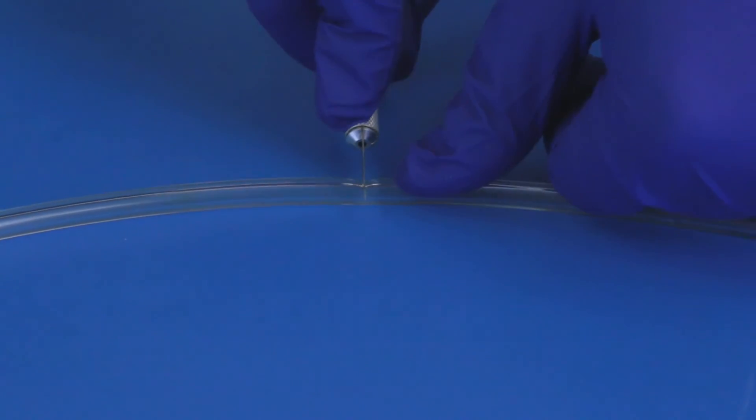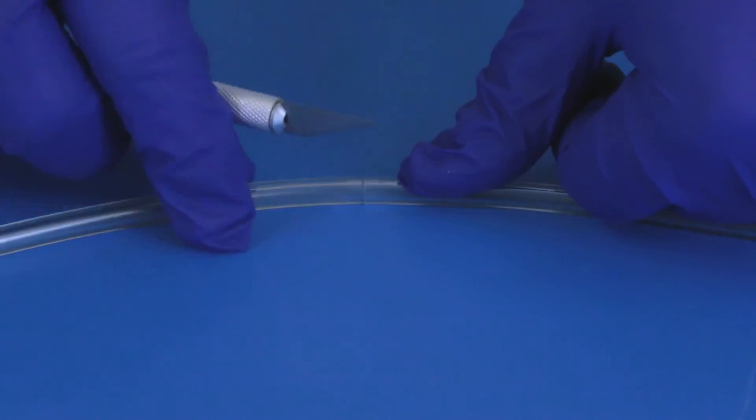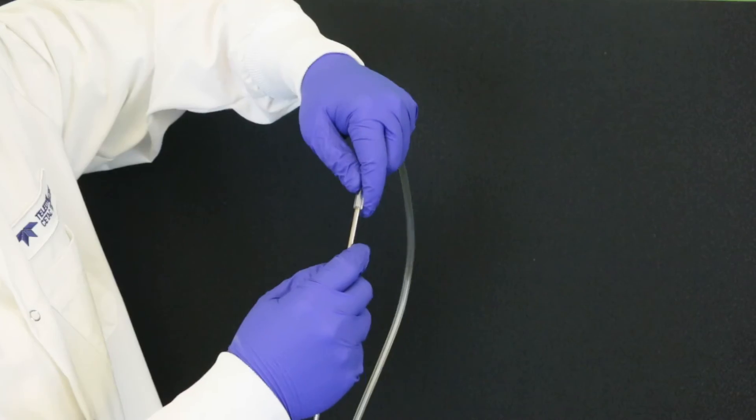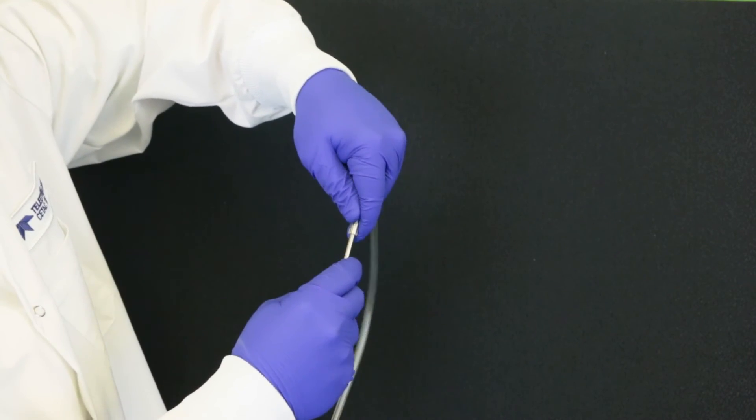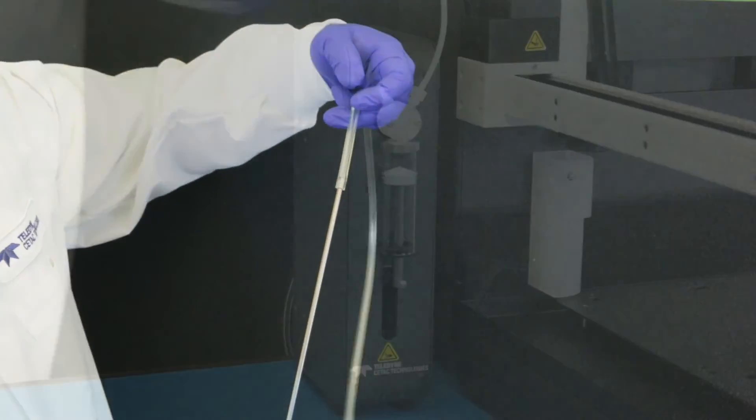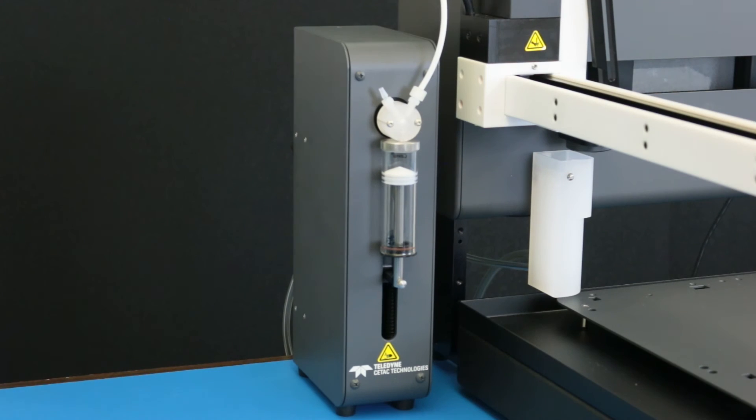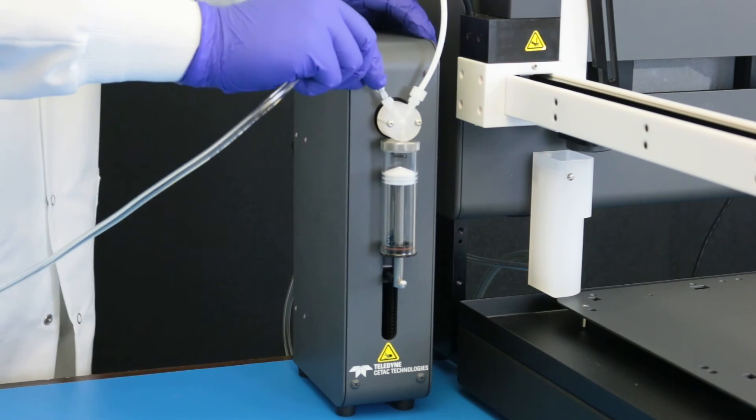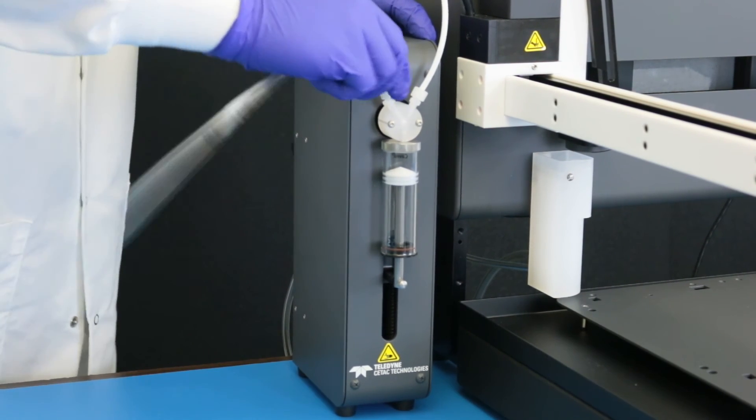Cut a length of 1/8 inch ID tubing long enough to reach the top of the bottle of diluent. Insert the remaining stainless steel rinse diluent tube into one end of this tubing. Press the free end of the tubing onto the fitting on the left side of the syringe pump valve.